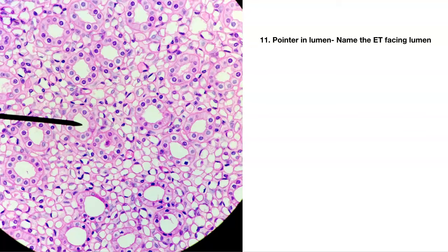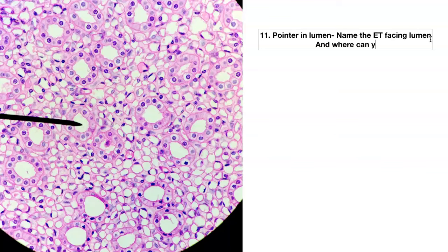Number eleven. Pointer is in the lumen. Name the epithelial tissue facing the lumen. And I'll add a second part: where would you find this?